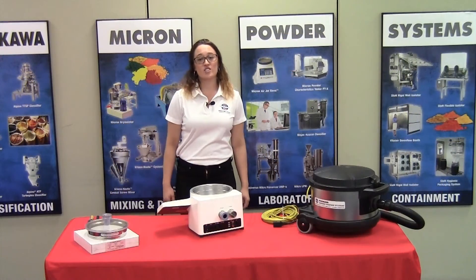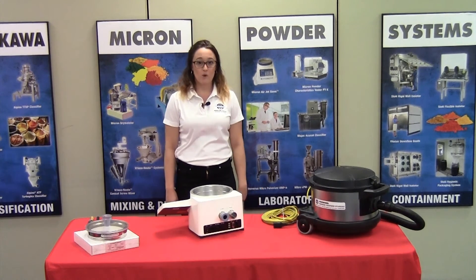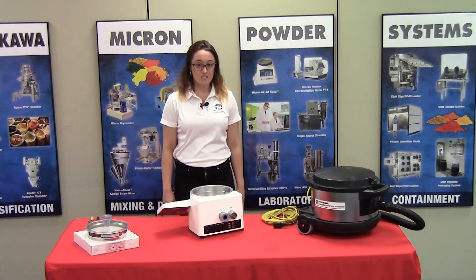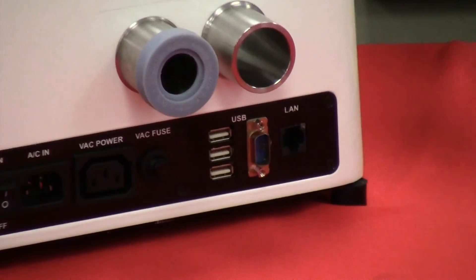For the initial setup of the unit, we're going to be plugging in the AC power cord, the vacuum power cord, and the vacuum hose. Please note that these components here are not used in the basic version.